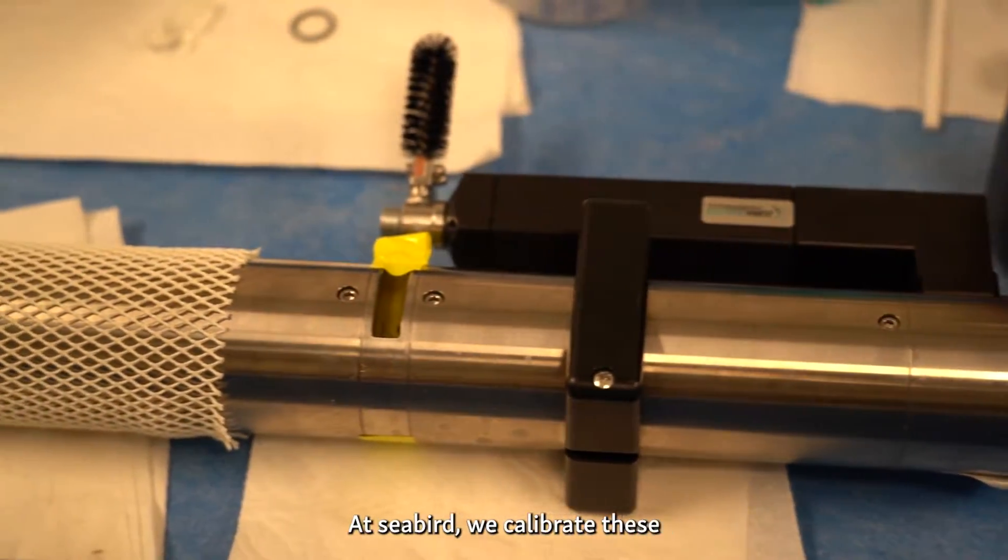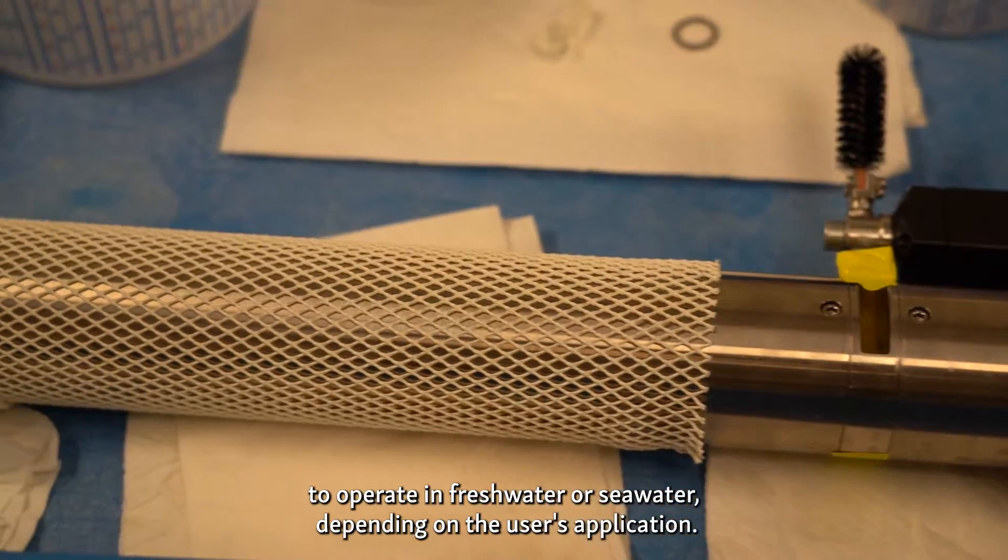At Seabird, we calibrate these to operate in freshwater or seawater, depending on the user's application.